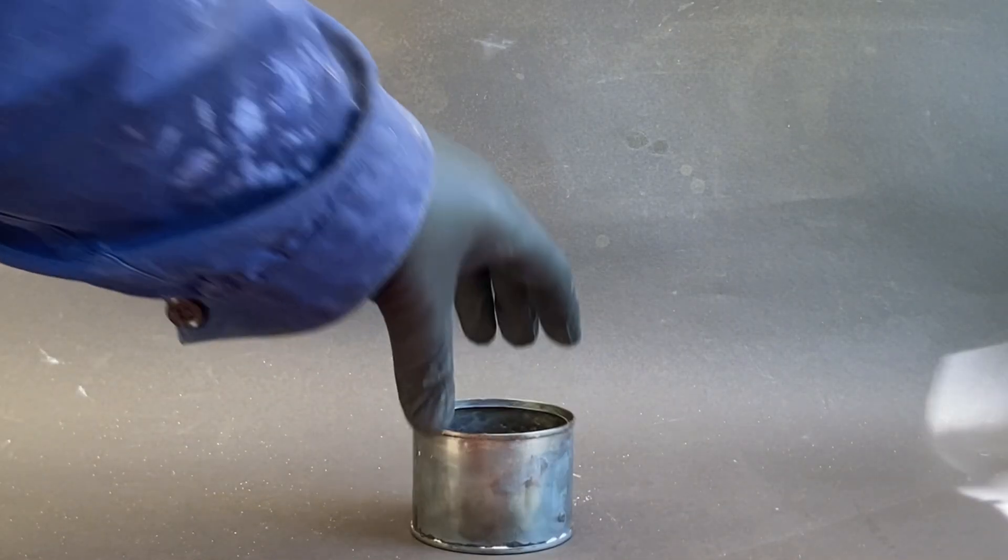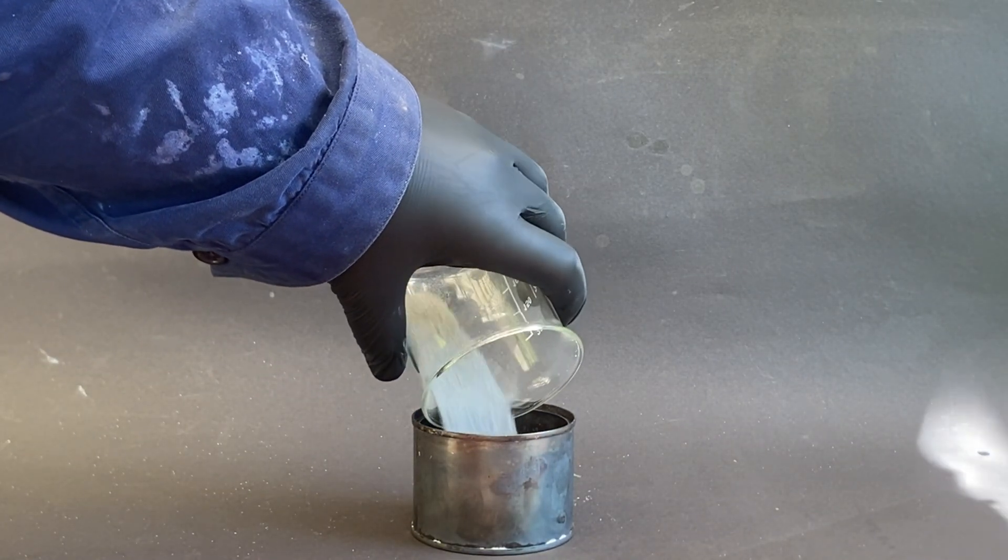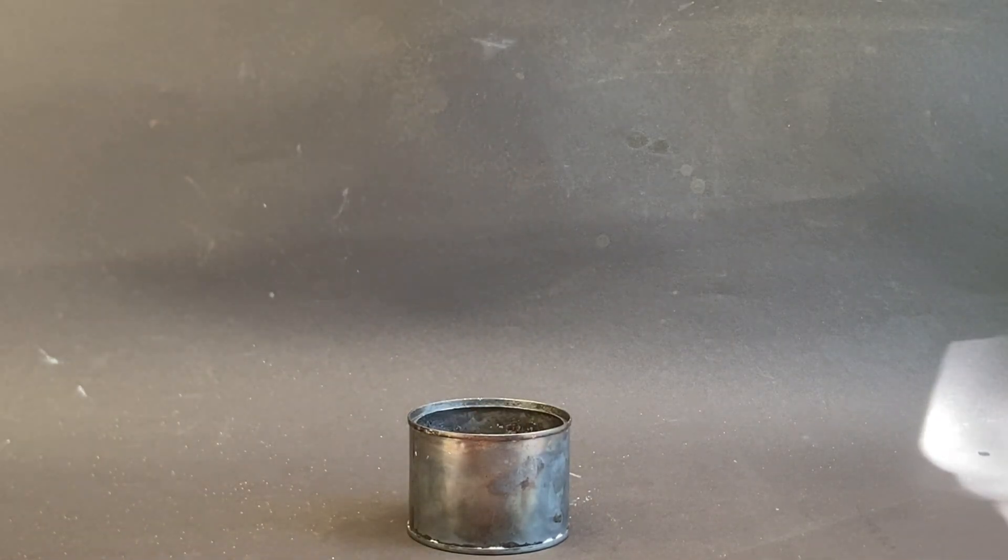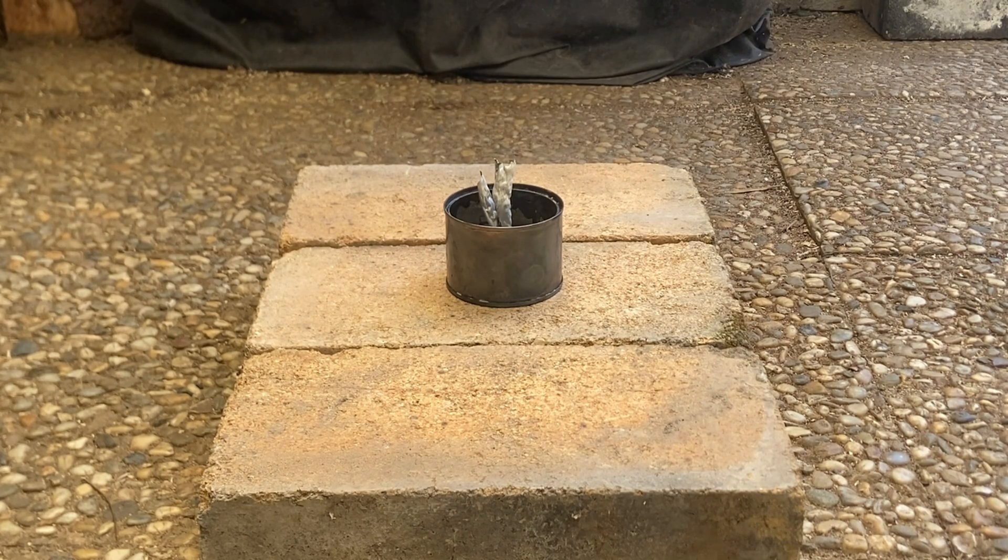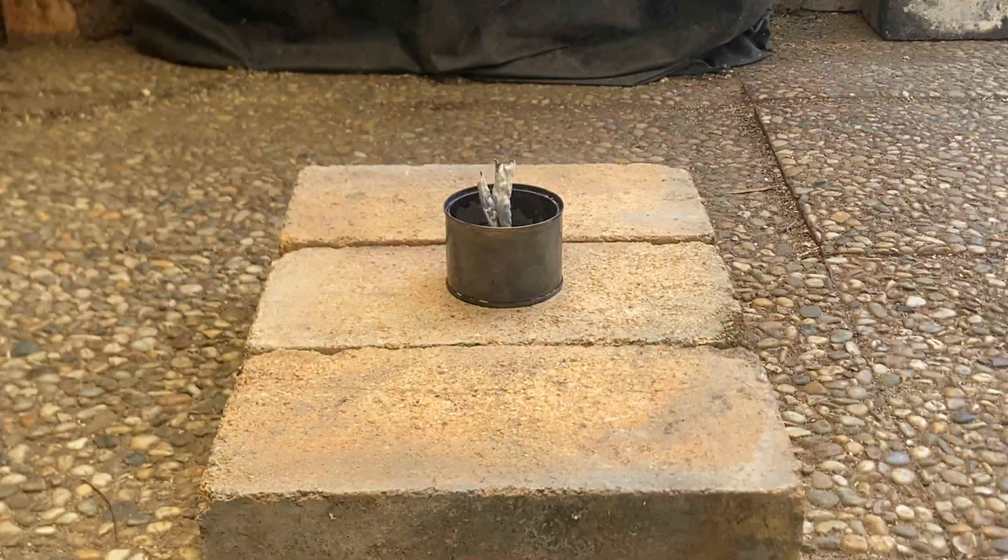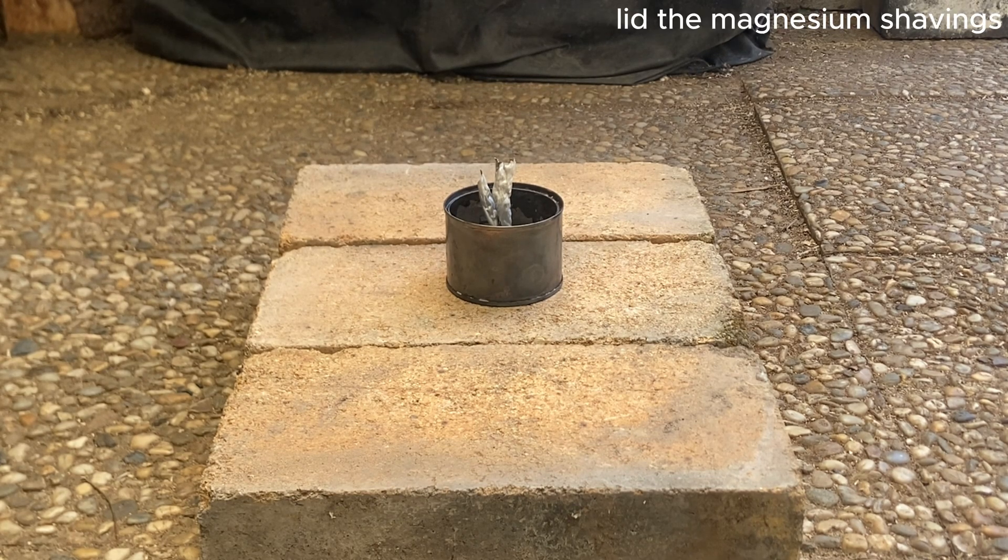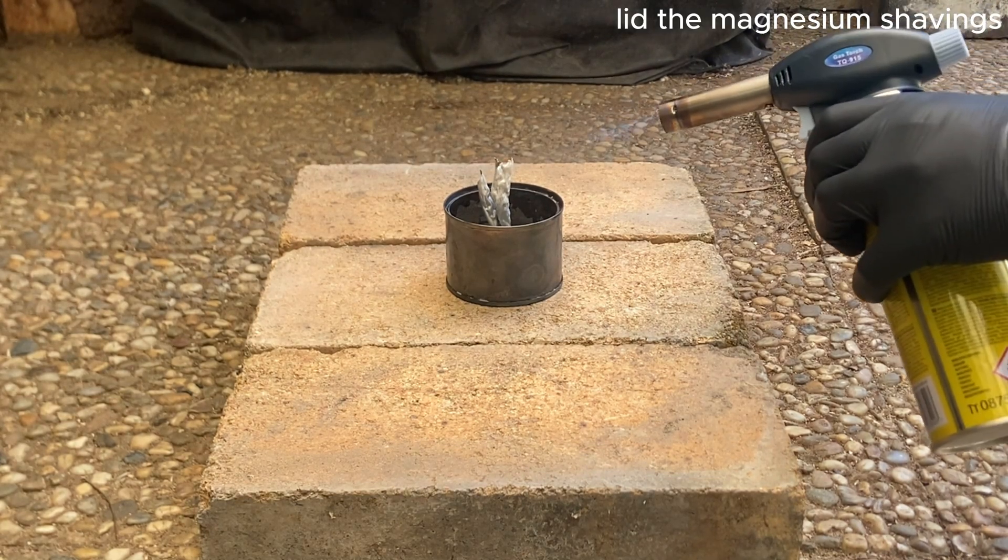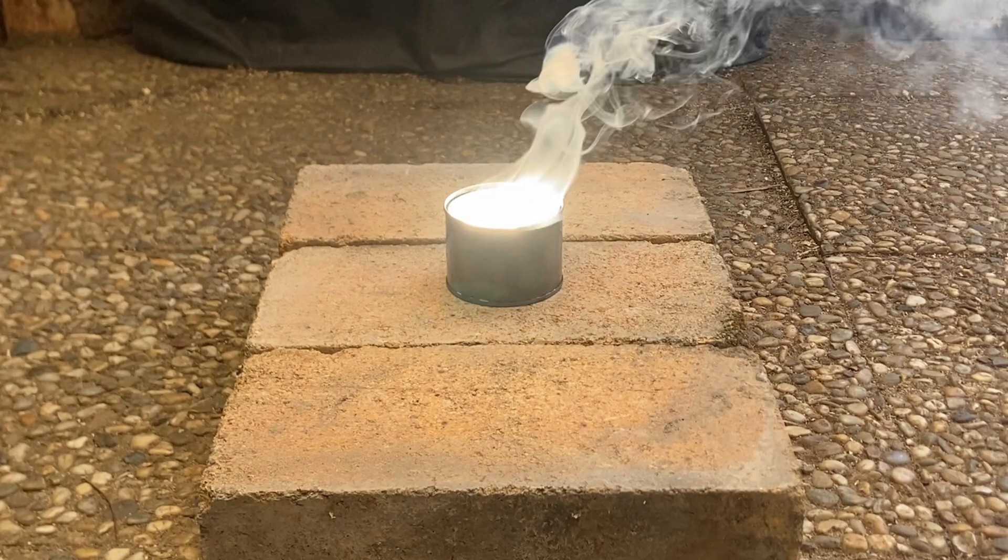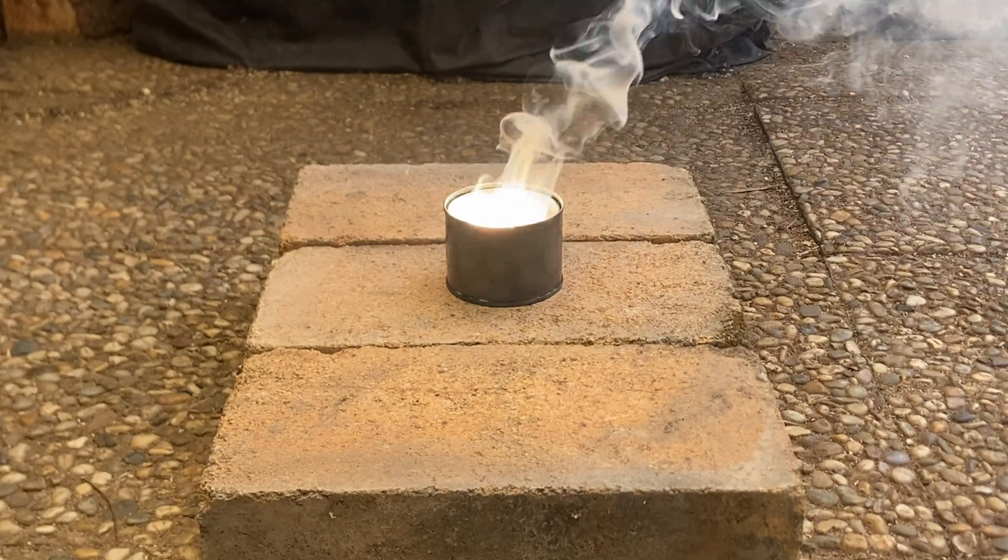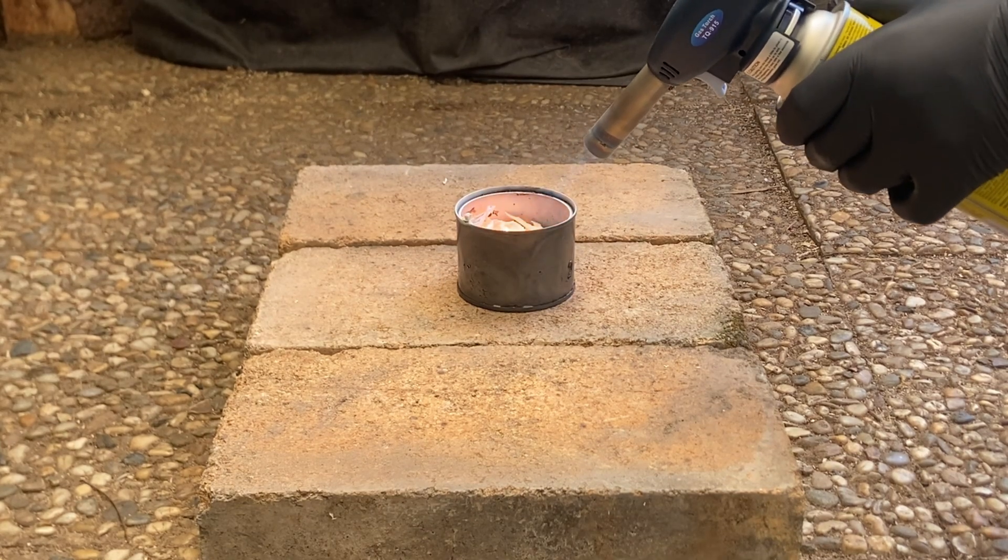Next I took the steel can from the previous reaction and filled it with the boron oxide magnesium mix. Afterwards I put few magnesium shavings into the mix and lit them. This didn't work, so I just heated the can until something happened.